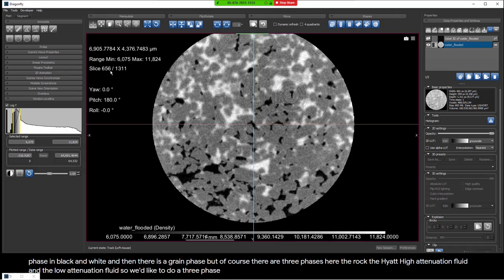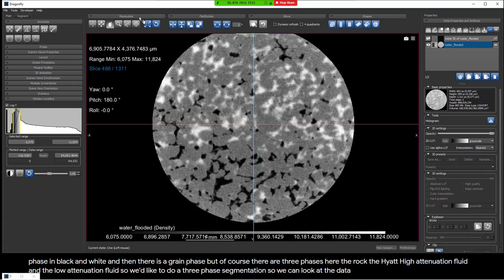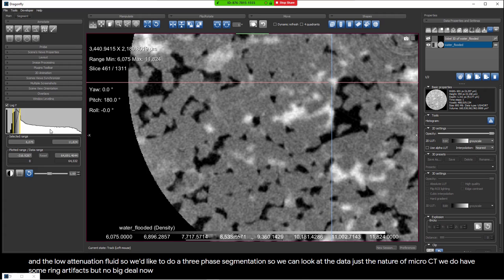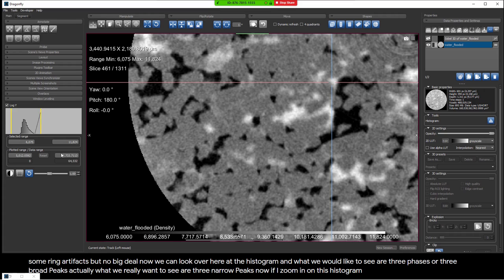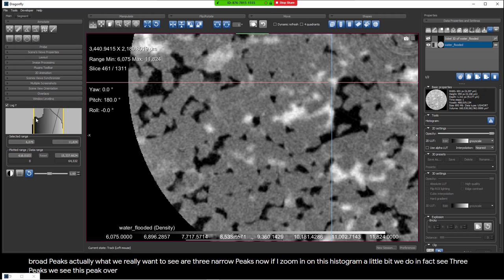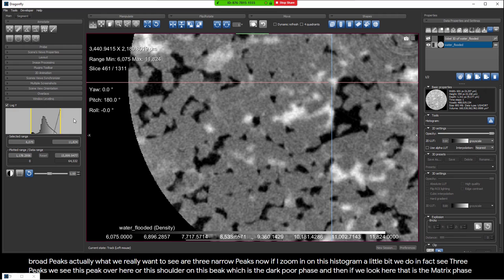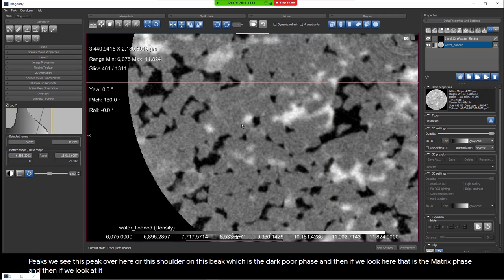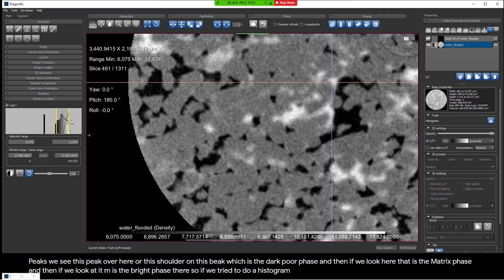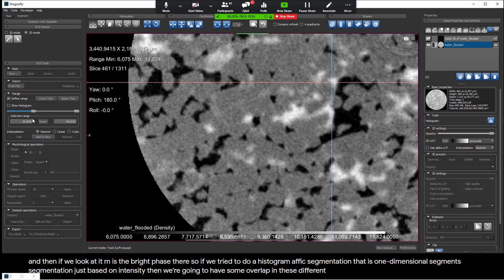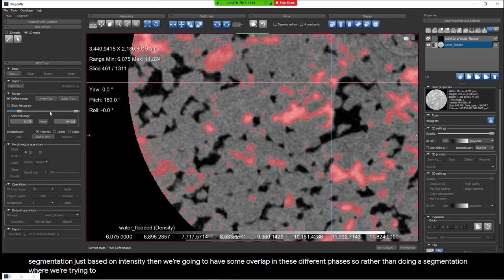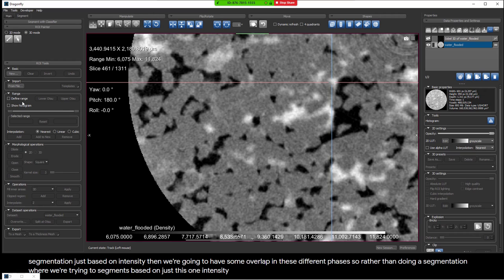It's not uncommon to have a rock saturated with a fluid and then do an imbibition or drainage experiment where you pump in another fluid — in this case stained with a high X-ray attenuation stain, making it much brighter. So the pore space is all the black pixels and all the bright pixels. There are three phases: the rock, the high-attenuation fluid, and the low-attenuation fluid. If we look at the histogram, we'd like to see three narrow peaks, and zooming in we do see three peaks — with some overlap between phases.